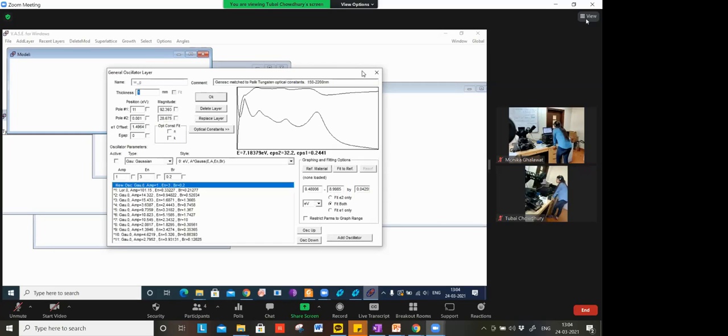And this tungsten sample, is it completely tungsten metal, or have you deposited it over something like silicon? So what is it exactly? This sample is a silicon substrate, silicon wafer. Silicon dioxide will be there because it got oxidized. And over it someone has coated tungsten.